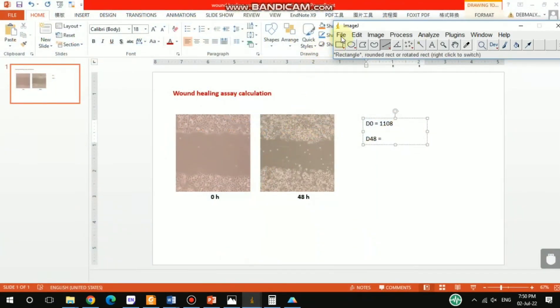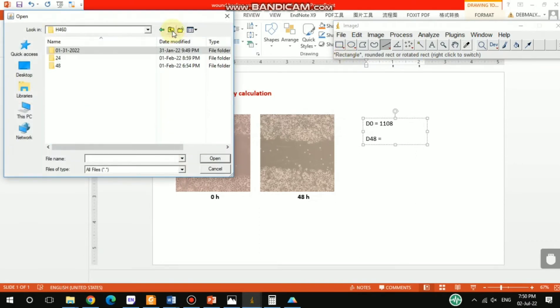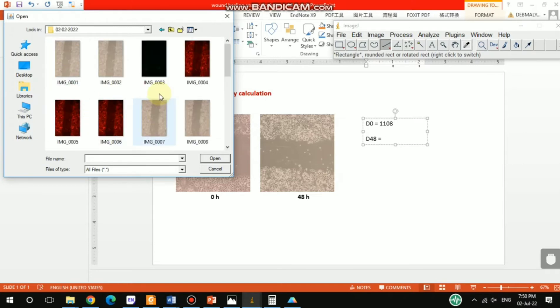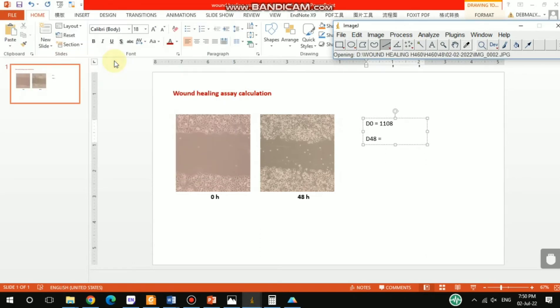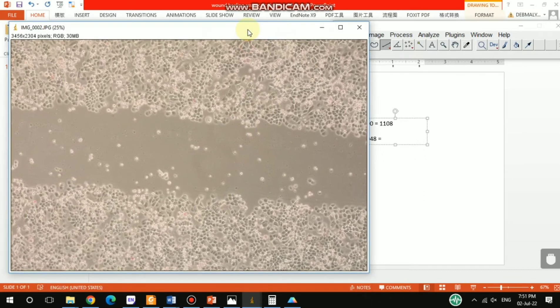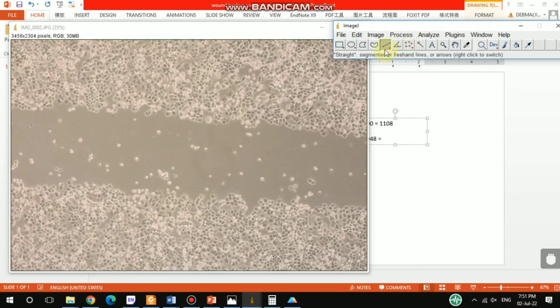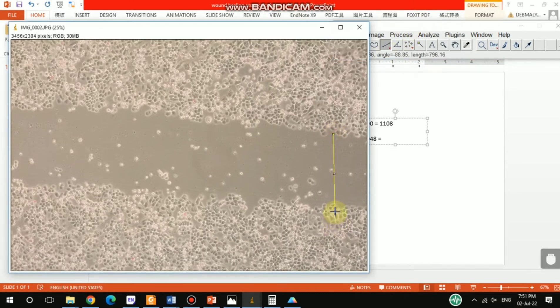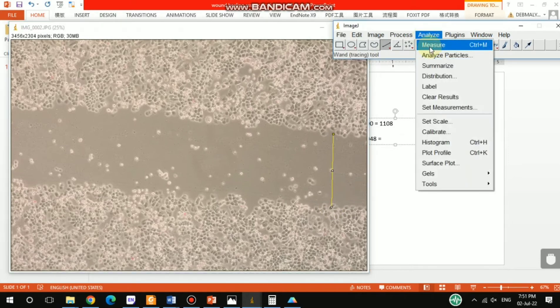Now let's start with the 48-hour image. Open the image file for 48 hours. As you can see in these pictures, the cells have migrated after 48 hours. Let's measure this distance — go to Analyze and Measure to get the first value.